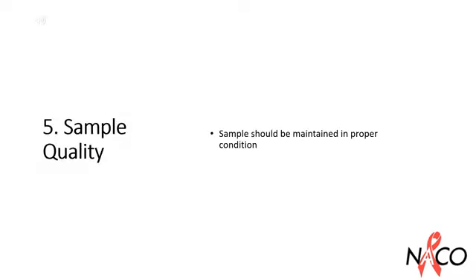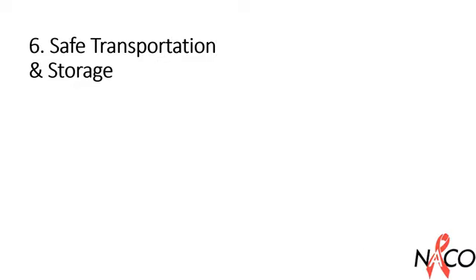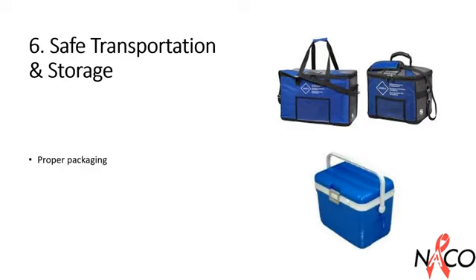The quality of report generated by the laboratory always depends on sample quality. The sample should therefore be maintained in proper condition that would result in necessary preservation in order to ensure that the quality of the results are satisfactory. Proper packaging, safe transportation, and appropriate storage of biological samples will ensure improved quality of test results and overall safety.